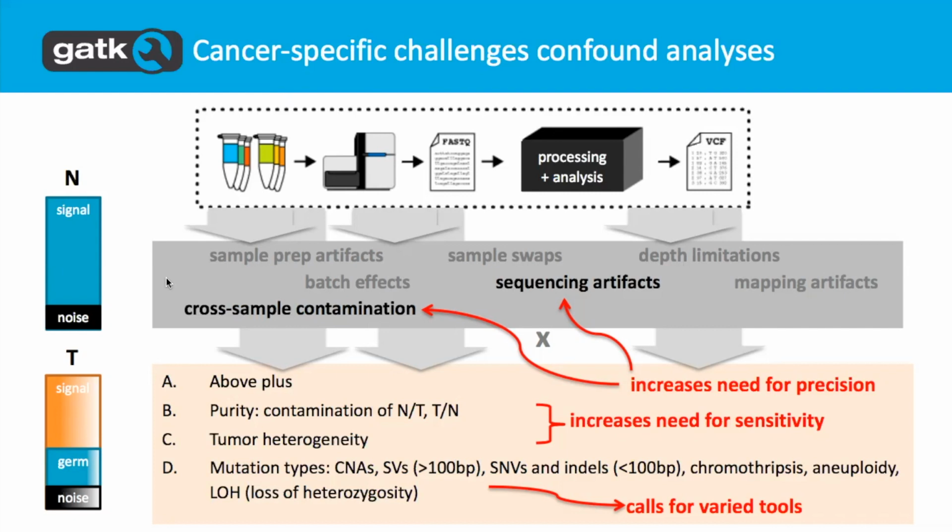But in the somatic context, that might be potentially an allele frequency where you need to be able to retrieve actual somatic variants. So that's going to be more of a problem. And same with sequencing artifacts that appear only at very small frequencies, so you don't have to worry about them in germline context. For somatic, you actually do have to worry about them because that might be the level at which you need to retrieve somatic calls.